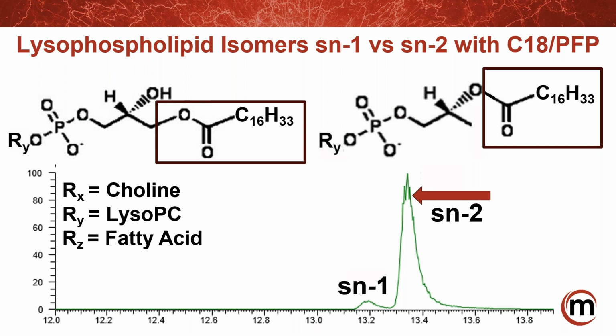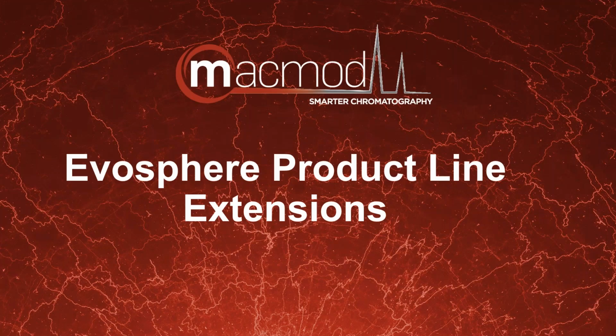One very close molecular structure, but slightly differences. That's how powerful the phase is, and using it on the monodisperse particles.